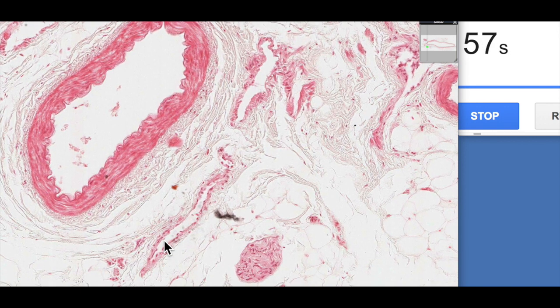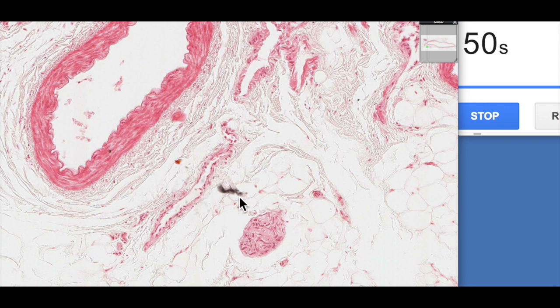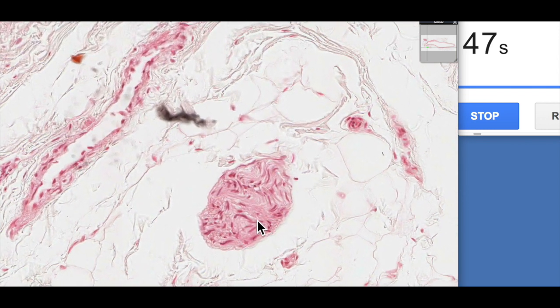Adjacent to that we've got a vein, you can see very thin walled, irregular in shape, a little bit of smooth muscle in the wall there but very thin wall. And then this little structure here, this is actually a little nerve.